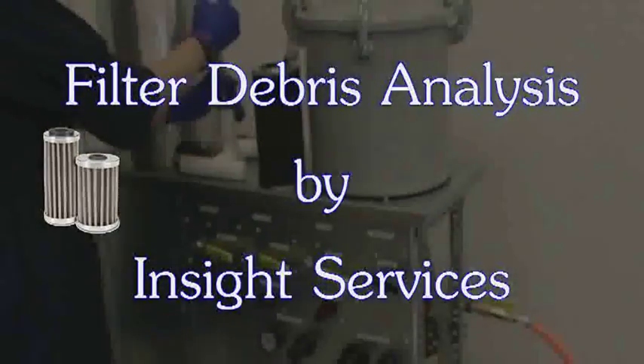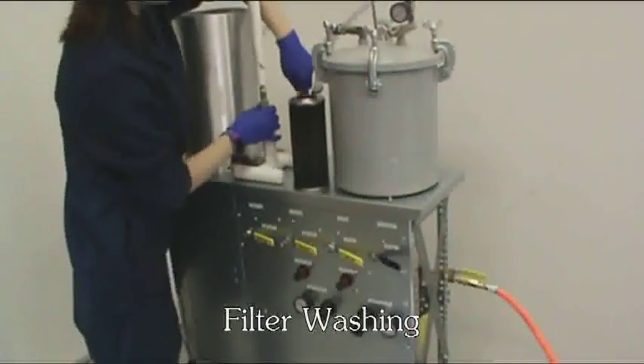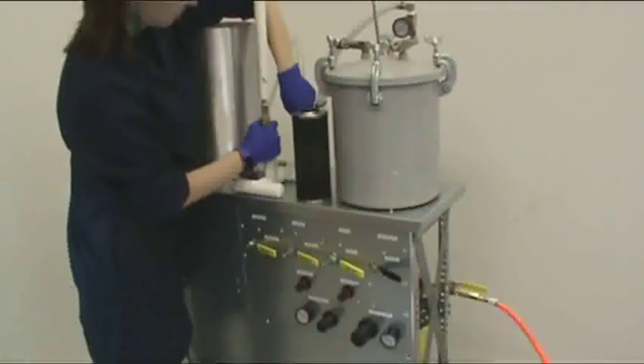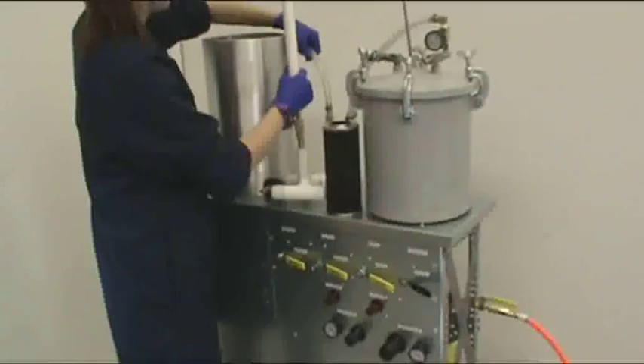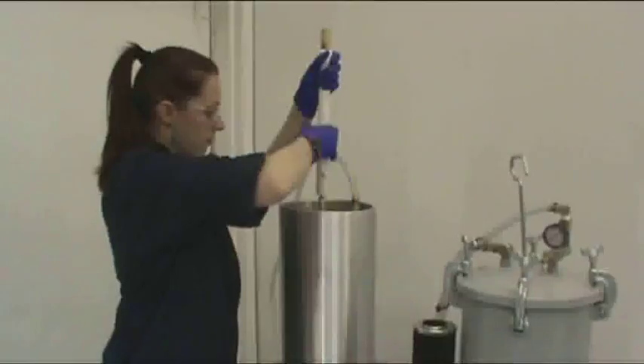InSight Services now has a brand new filter debris analysis offering. Our first step in the new offering, and one of the most significant changes, includes a brand new filter washing instrument that was designed by one of our very own InSight team members.